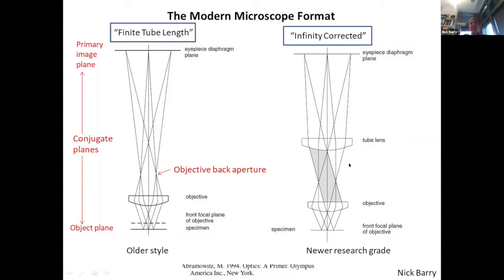You can bring in things for manipulating the sample, like a photo bleaching beam or something like that. So in this gap, this so-called infinity space, is where you've got the freedom to do that, and you don't really have that here because this distance from object to image is rigidly constrained, whereas only really the distance from the tube lens to the image is rigidly constrained. This bit, you have some flexibility.